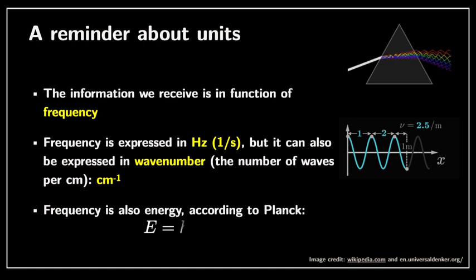So the frequency is also energy, of course. We know from the Planck relationship that frequencies and energies can be converted from one to the other. So sometimes people even use milli eV for the x-axis, so do not be surprised if you see that in the Raman spectrum.